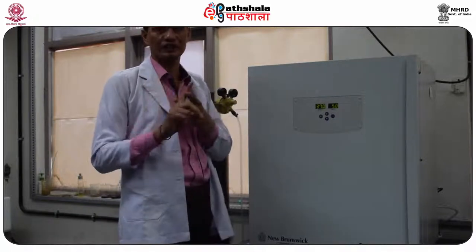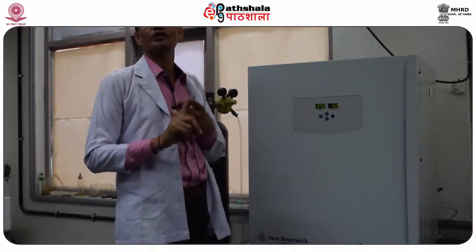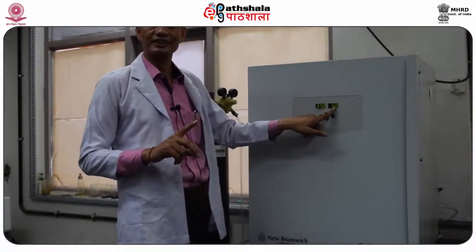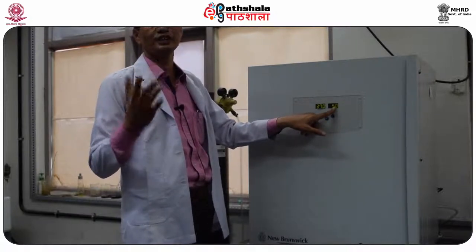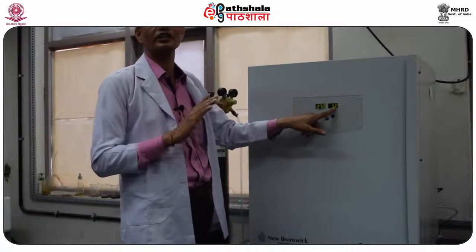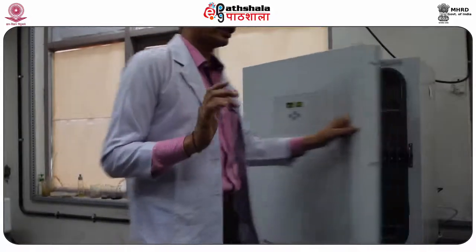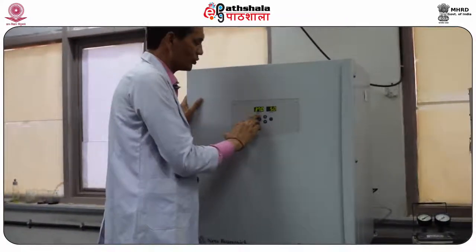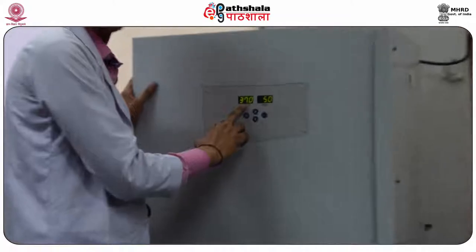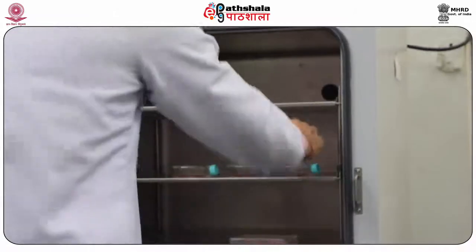This is one of the basic pieces of equipment required for animal cell culture technology, known as the CO2 incubator. It performs three functions. First, incubation of the cells. Second, it provides carbon dioxide, 5% carbon dioxide, which is responsible for maintaining the pH of the media. And third, it provides the humidity as per the requirement of the cells. First, it is utilized for incubation of cells at a particular temperature. For example, our incubator is set at 37 degrees Celsius as per the requirement of the cell line growing in it.